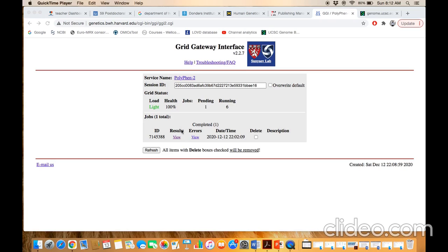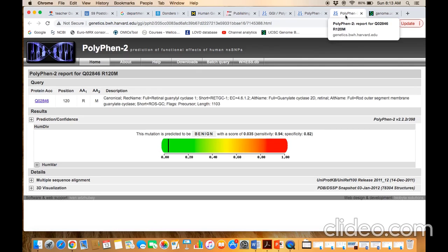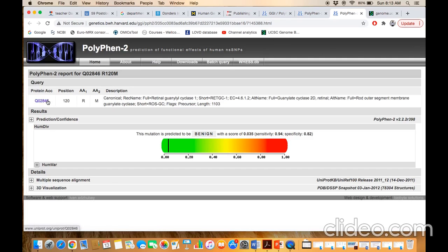You will see that the result is generated as a hyperlink. Just click on this hyperlink button and you will be navigated to another tab where you can see the complete result. Now you can confirm that the sequence pasted in the query box belongs to the correct gene. This is the UniProtKB accession ID. You will navigate to the UniProtKB page and there you can see which protein sequence you have pasted. Secondly, make sure that this position is 120 — the amino acid before change and after change. If you scroll down, you will see the wild type position and the variant.